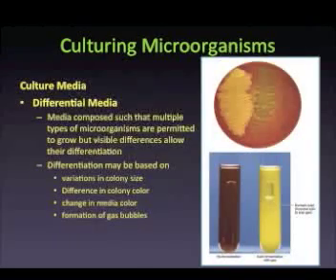In this particular image, phenol red is the pH indicator. Phenol red is a pH indicator that is red at neutral and alkaline pHs. Phenol red turns yellow at slightly acidic pHs. If an organism can metabolize the carbohydrate present, an acid is produced and the indicator turns yellow. If a gas is produced as a result, a bubble will form in the Durham tube.